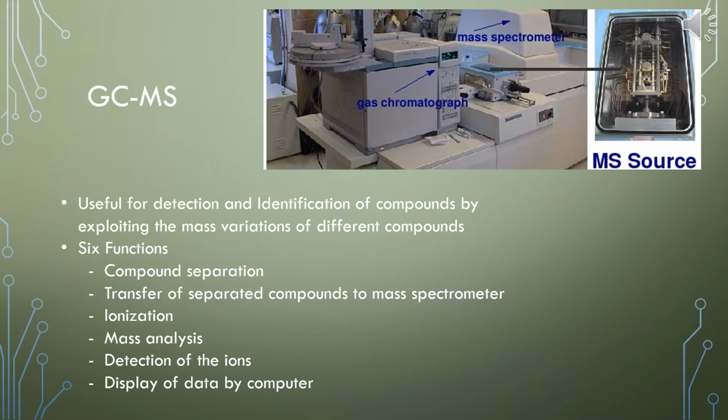The larger molecules are caught by the stationary phase. As the mobile phase moves through the column, the components are then separated based on their volatility and affinity of each phase. The compounds elute at different rates and are then analyzed by the mass spectrometer.